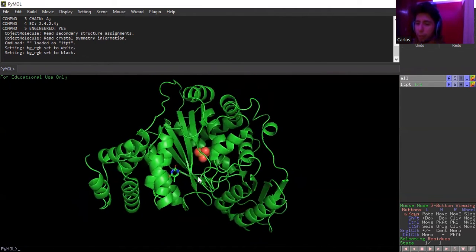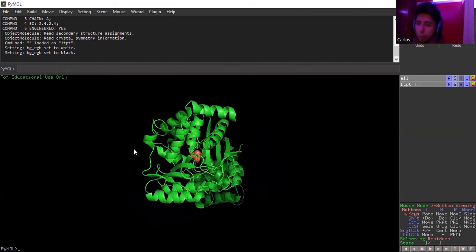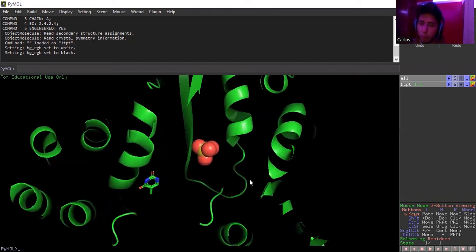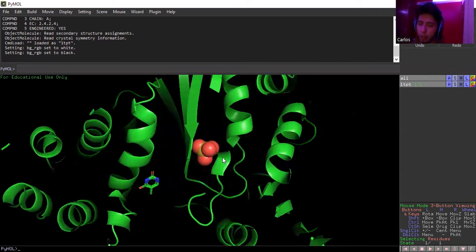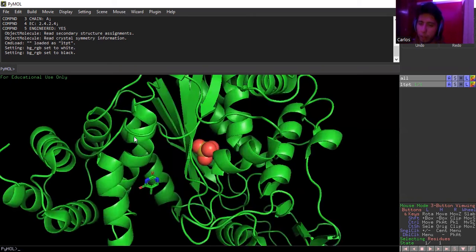And then we have our mouse scroll, where using this we can change the layers that we see. In this case, we are removing the top layers, so we won't see this part of the protein. It will vanish, so we can see the parts in the back, which we wouldn't normally see with everything else in the way.